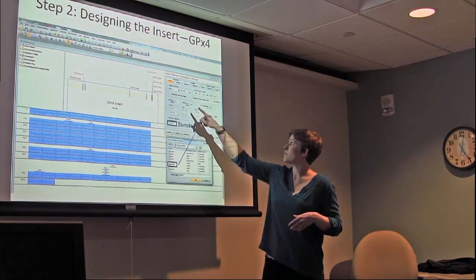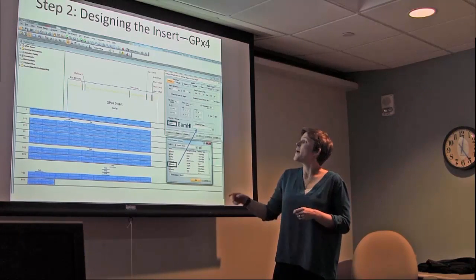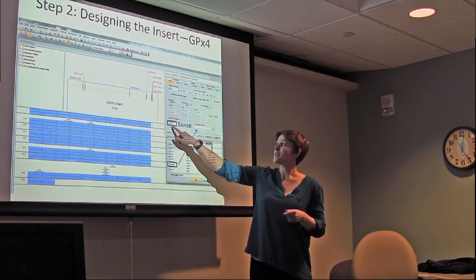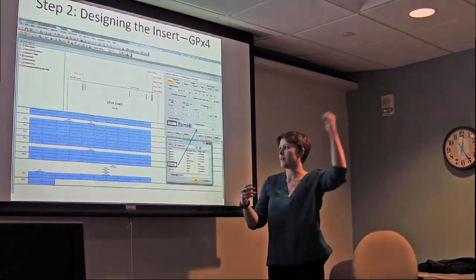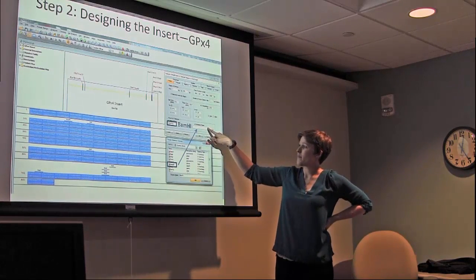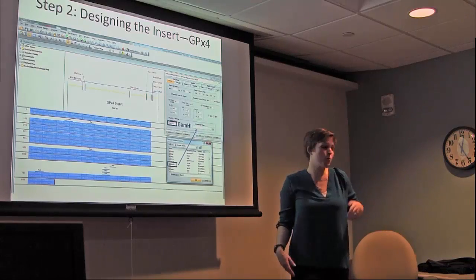You ask it to amplify the entire thing from 1 base pair to 820 base pairs. But you can add a 5' terminus to each of your primers. So for your sense primer, which would be amplifying this 5' end first, you would add that BamHI restriction site. To your antisense primer, you're going to be adding the HindIII restriction site.